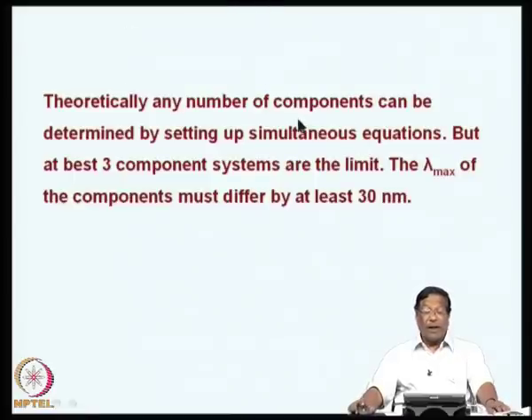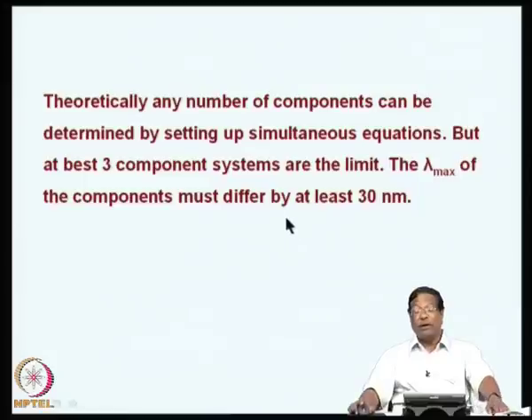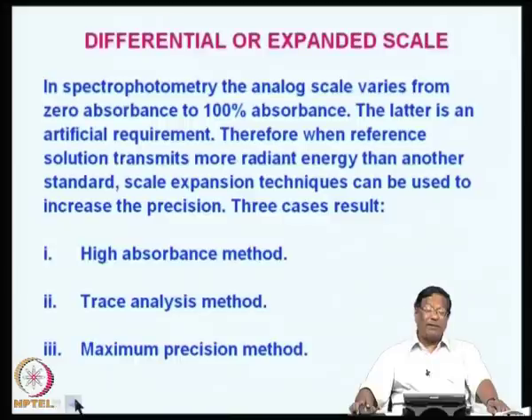So, theoretically any number of components can be determined by setting up simultaneous equations, but for all practical purposes one can handle three component systems; more than that it becomes slightly difficult, and the lambda max of the components also have to differ by at least 30 nanometers. So, simultaneous equations can be done, and then differential or expanded scale.